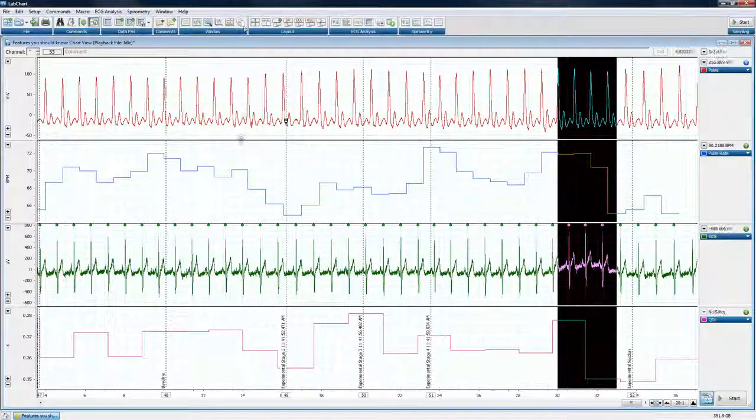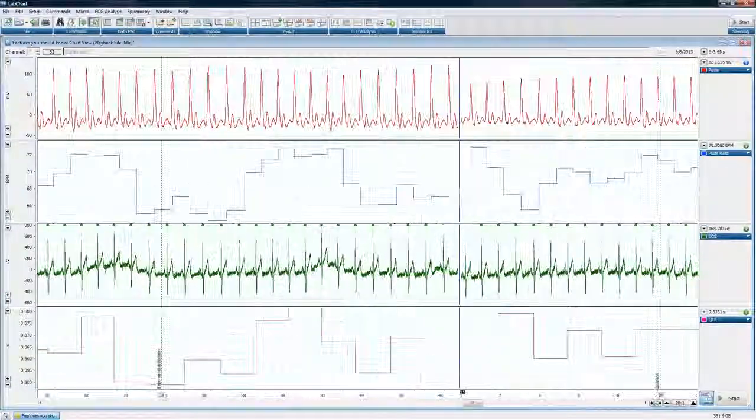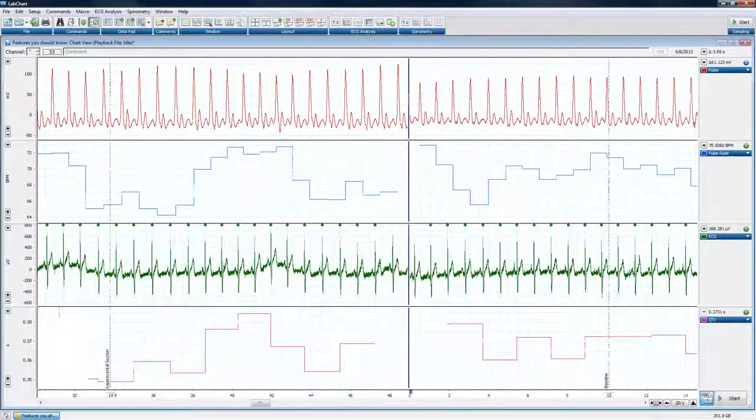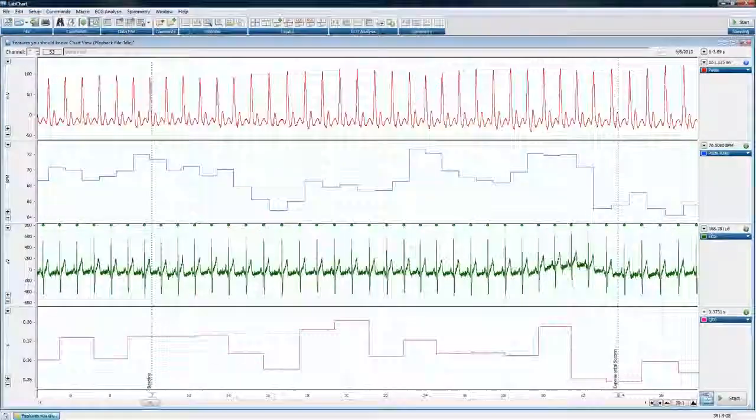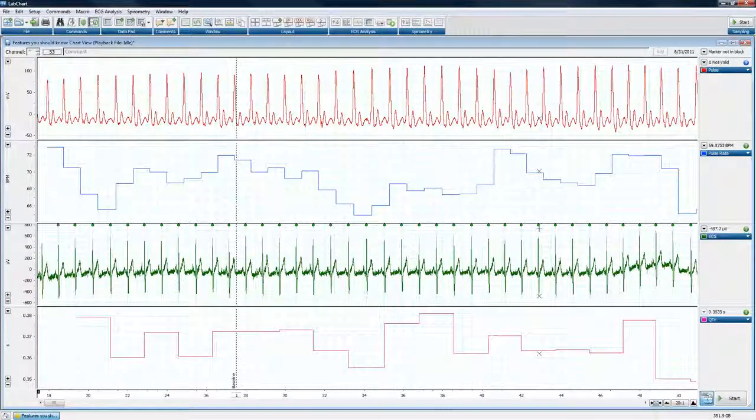Now, I realize that because you guys are watching this over a webinar, this may not come through exactly the right way. I urge you to go try this on your own and see what it looks like. Essentially, you're just scrolling through the data, you're seeing everything come in, and you're able to see all of the data in a short amount of time. It allows you, if you're looking for something specific, maybe a spike in the data or something like that, to look for that.